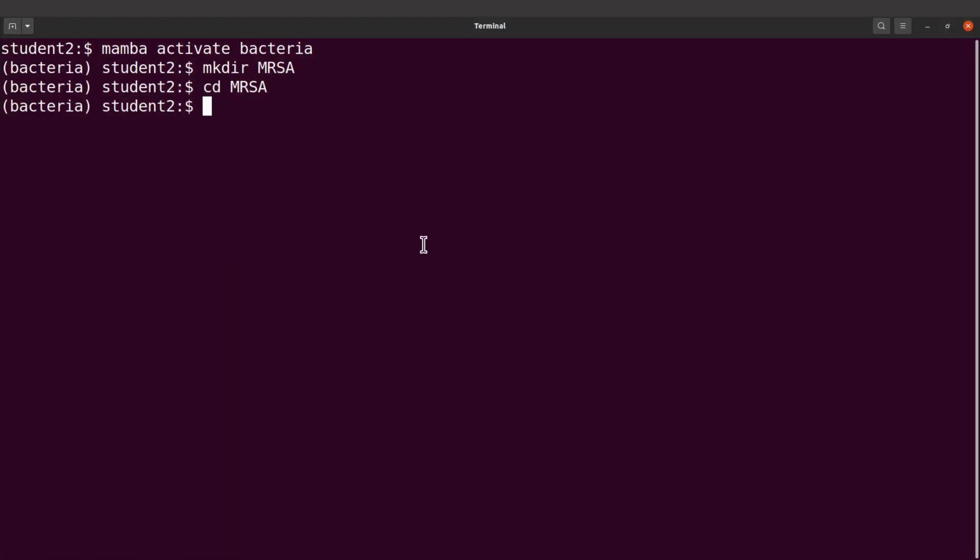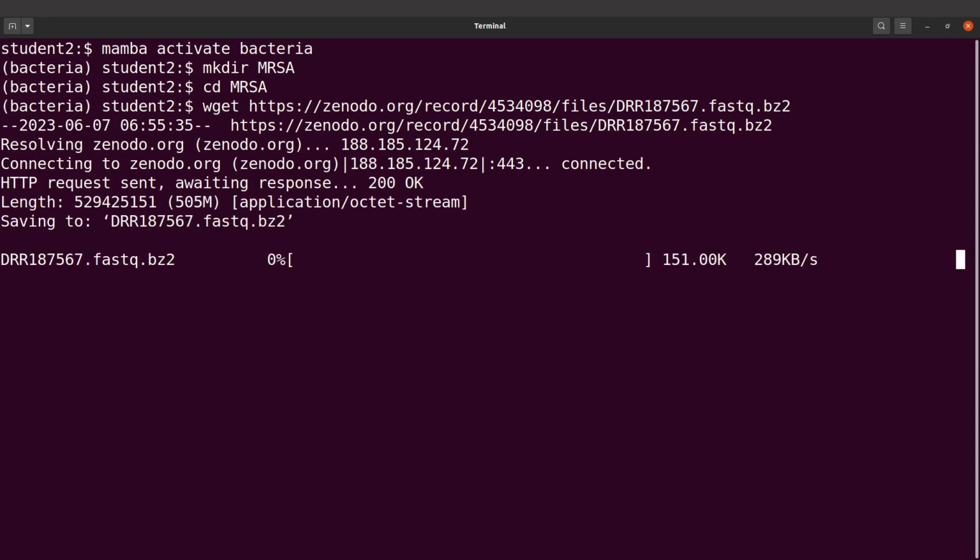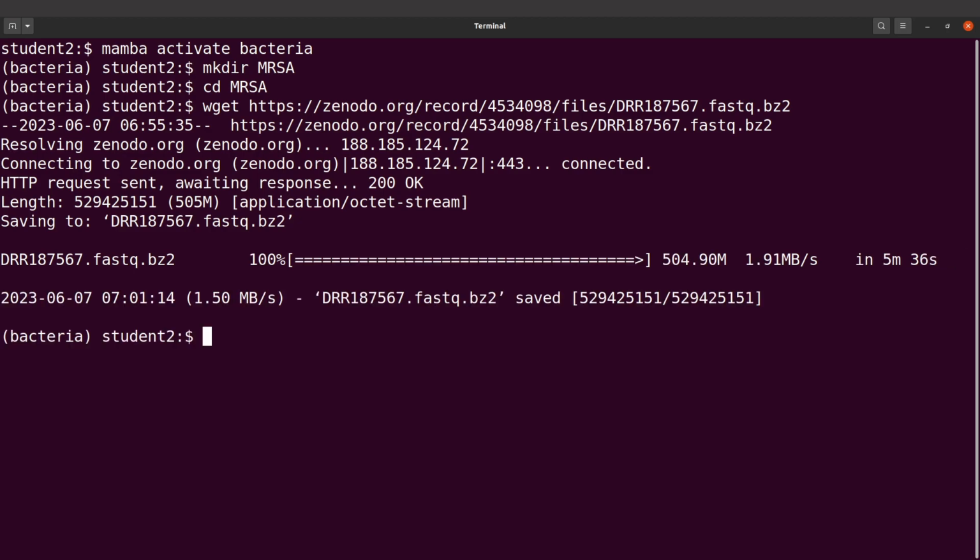And then let's download it. So I'll use wget, but you can also use curl. So I'll say wget, and then I supply it with the download link, which is this one here. So I'll execute this command now. So this will download the file for me. So let's wait for everything to get done for us. Okay, the file has been downloaded. So let's do an ls. We are going to find it there. So this is it.